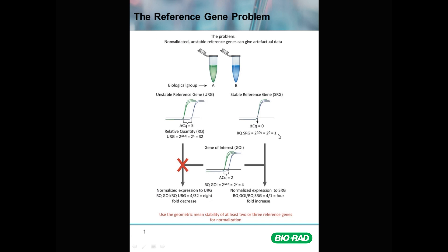If the gene of interest gives a delta CQ of two between the control and treated sample — a four-fold difference, two to the power of two — then when normalized to the unstable reference gene, four divided by 32 results in an eight-fold decrease. This would be the normalized expression difference for the gene of interest relative to the unstable reference gene. Whereas if we use the stable reference gene, four divided by one results in a four-fold increase in gene expression when normalized to the appropriate reference gene.